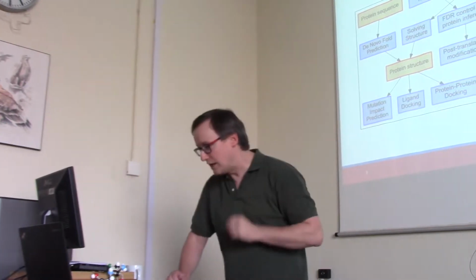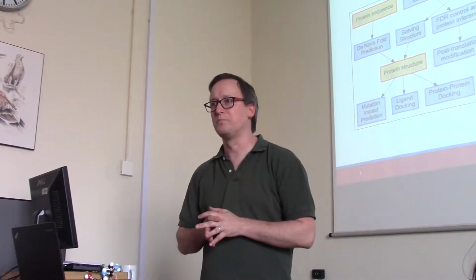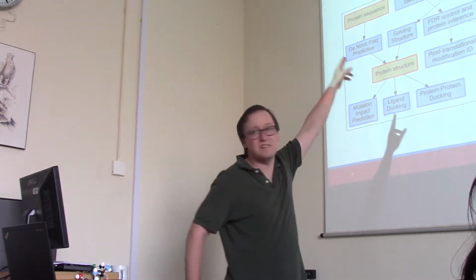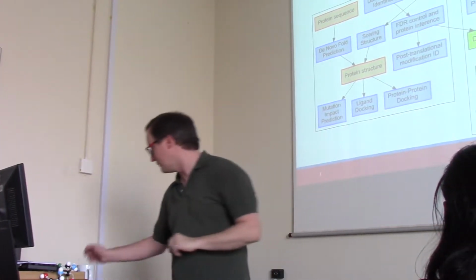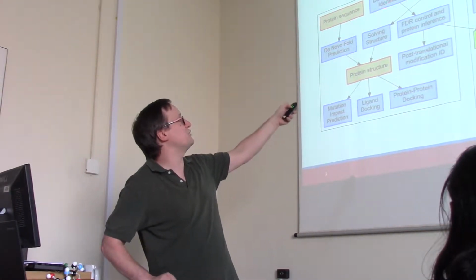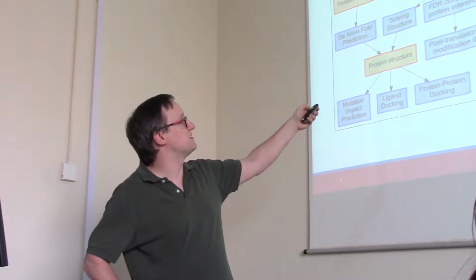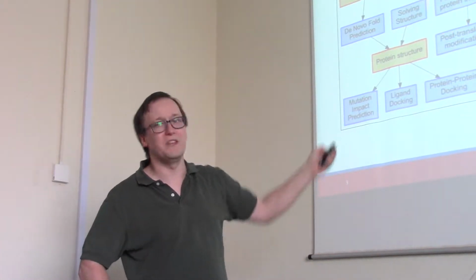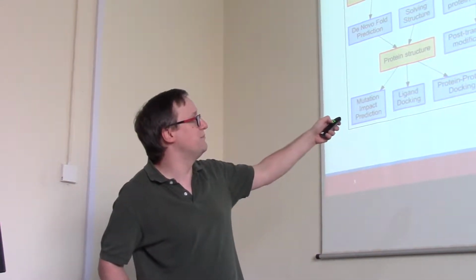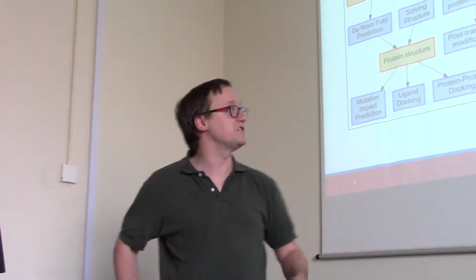All right, now we've been talking an awful lot about transcriptomes and genomes with our big diagram of all these different workflows. We're now moving into kind of this big jumble over at the left. We see that we have tandem mass spectrometry data entering at the top. Let me grab my laser pointer. We have tandem mass spectrometry data entering at the top, and we use database search identification, which also actually feeds off of protein sequences that we provide, produces identified spectra, which we then have to filter in order to keep just those that have solid hits, and we need to infer proteins from them. And in some cases, we go on to do differentiation to ask which proteins changed between these cohorts.